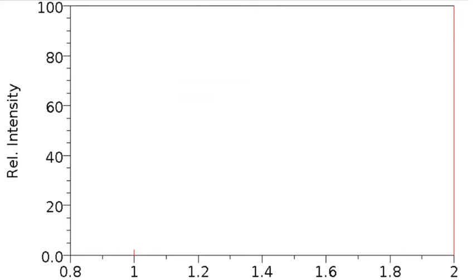The first spectrum on your handout is hydrogen here. So the red line, I know it's not red on your handout, that's basically all the hydrogen. So you can see that hydrogen comes as H2, so its mass is 2.